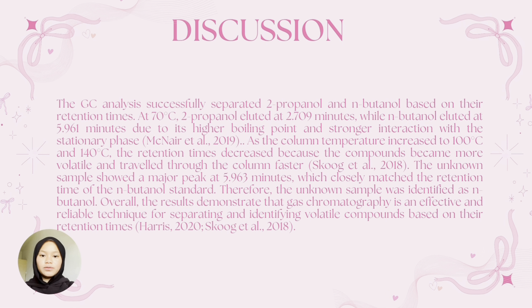Now, let's talk about the discussion of our gas chromatography experiment. The aim was to identify an unknown sample by comparing its retention time with known standards. The pure 2-propanol standard had a retention time of 2.709 minutes, while the n-butanol standard had a retention time of 5.961 minutes. The unknown sample showed a major peak at 5.963 minutes, which closely matched the n-butanol standard. Therefore, the unknown sample was identified as n-butanol.